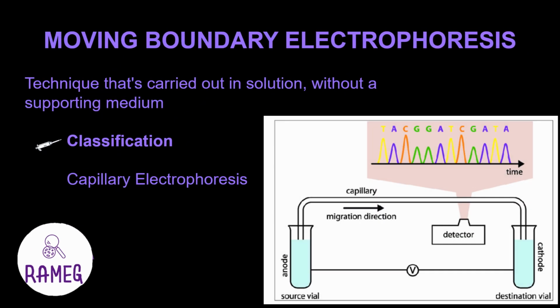So moving on to moving boundary electrophoresis, compared to zone electrophoresis, which required a supporting medium, moving boundary does not require a supporting medium. Instead, it is done in a freely moving solution. Based upon that, the type of technique which is mostly used is capillary electrophoresis.